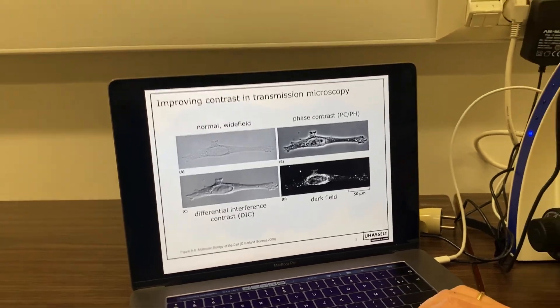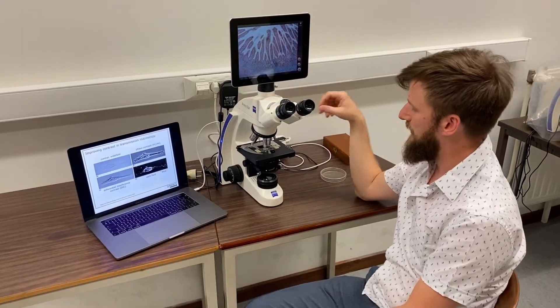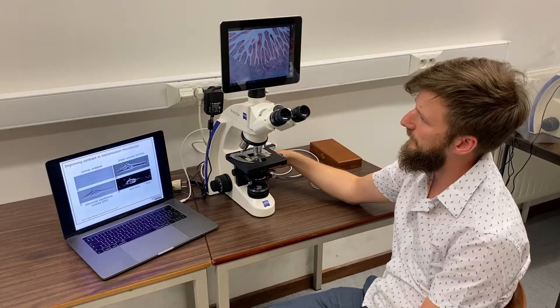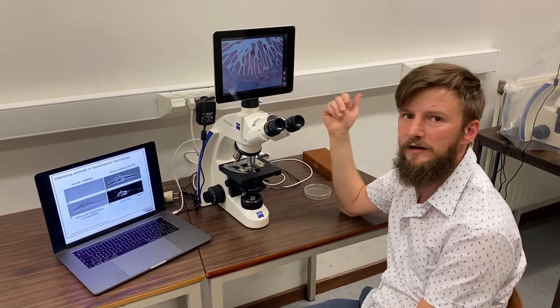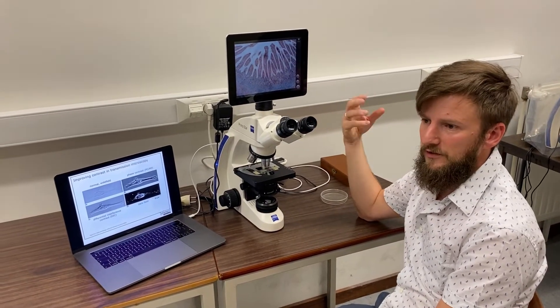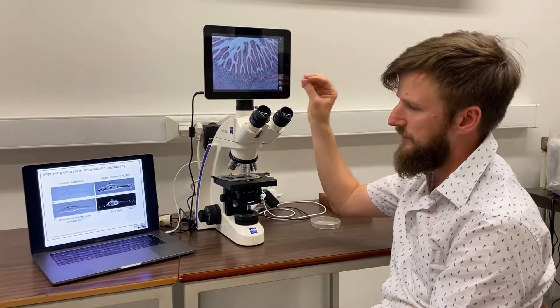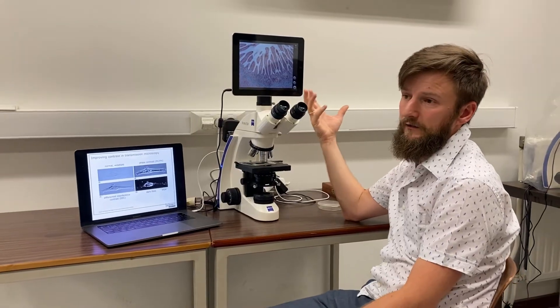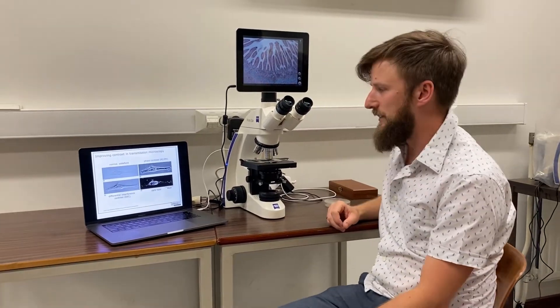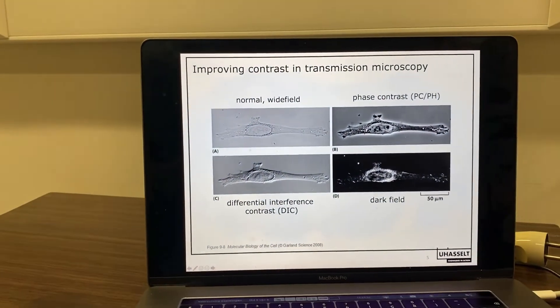Biological samples can often be stained — as done here with H&E staining, which is typically used for revealing features in biological samples. But sometimes you cannot do an H&E staining, for example in live samples. Then the problem is that biological tissue has very low contrast, so you need a very good microscope to reveal details. In standard laboratory settings you are often limited to a standard microscope, which is why there are different alternatives to normal wide-field microscopy that address the low contrast problem.